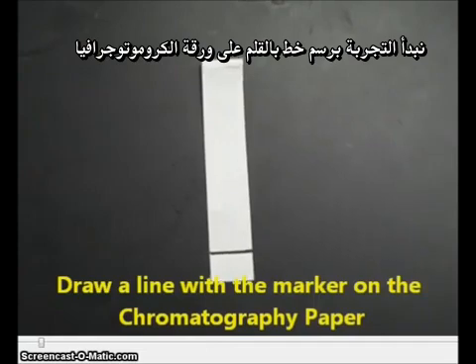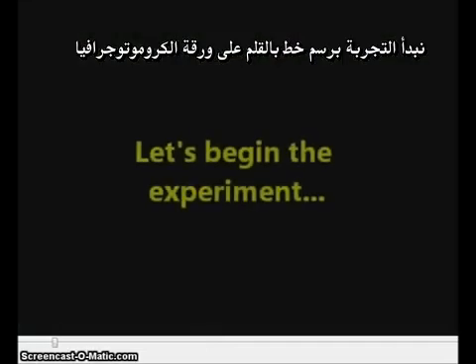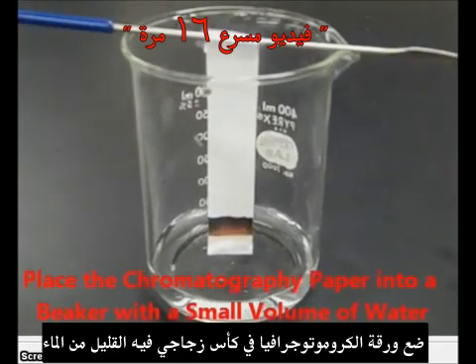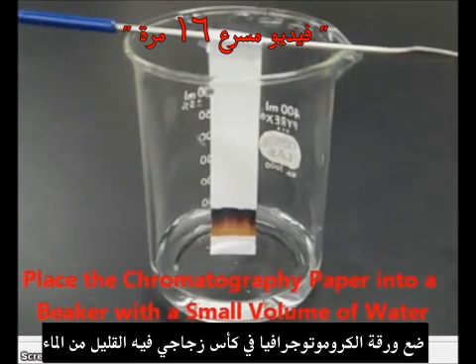We'll start our experiment by drawing a line with the marker on the chromatography paper. Then what we want to do is insert that chromatography paper into a beaker with a small volume of water in it.